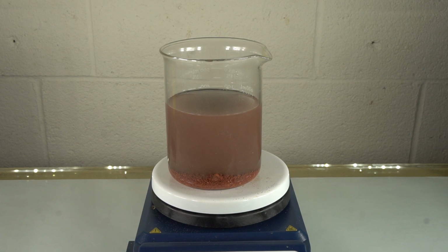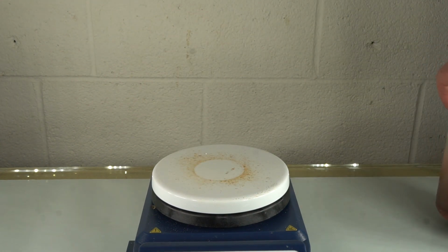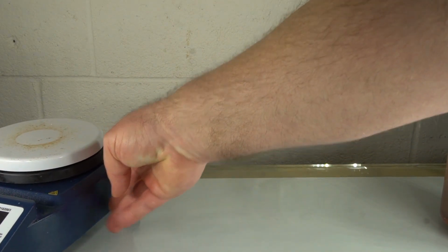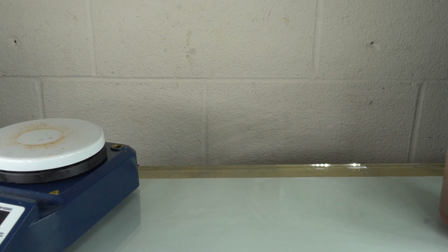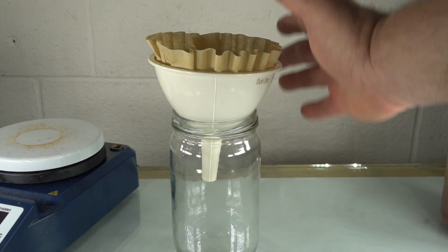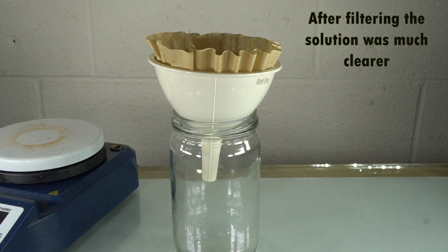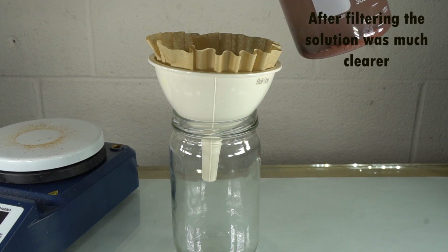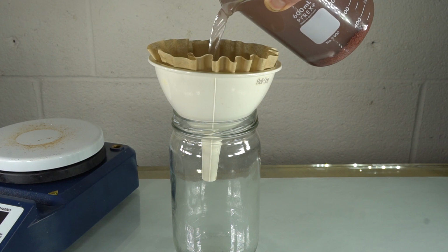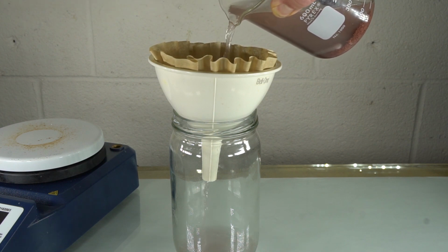So now what we're going to do is filter this. So let's take this off and move our hot plate stirrer out of the way. And by the way, I never used the hot plate today. I only used the stirrer part of it. Now this copper at the bottom, by the way, I'm using just a coffee filter and a jar. Gravity filtration works quite nice.